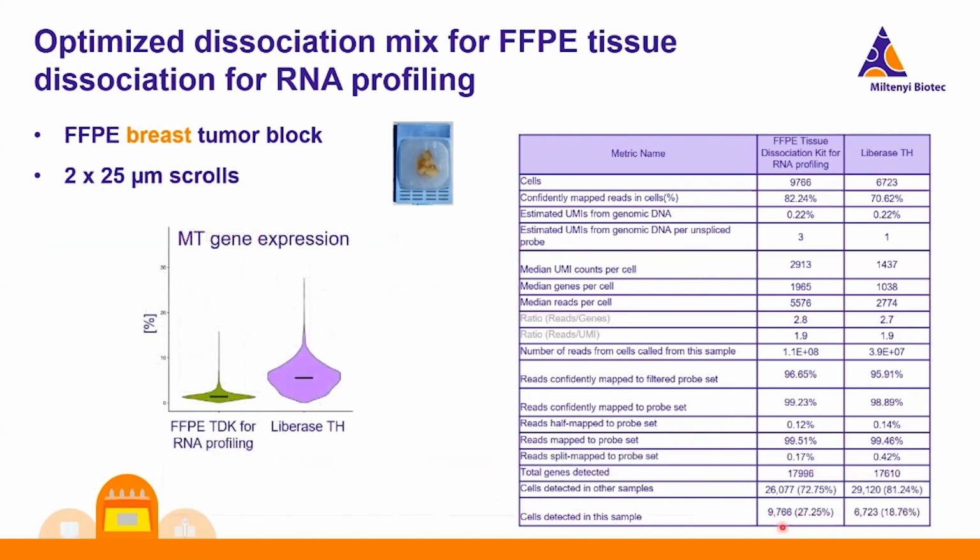So single nuclei RNA sequencing, why do we think that we are performing that and not single cell? It is also what 10x thinks. They think also that the majority of reads are actually coming from nuclei and not from whole cells, which were extracted from the FFPE tissues.